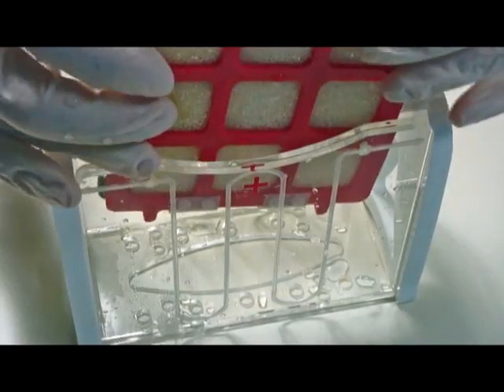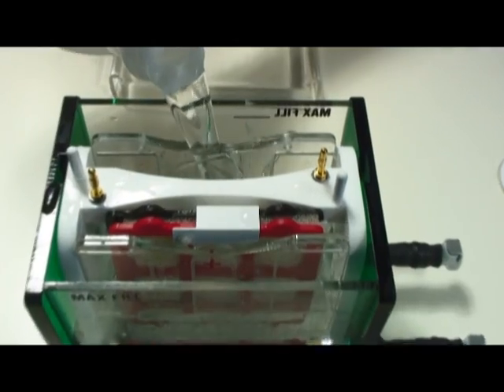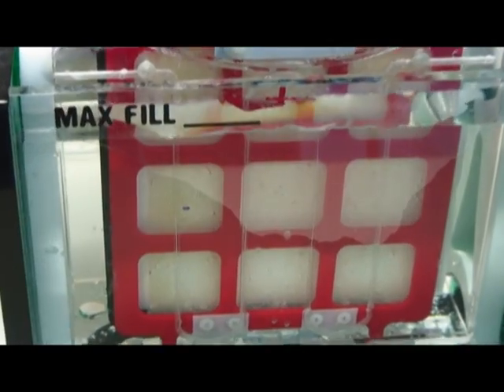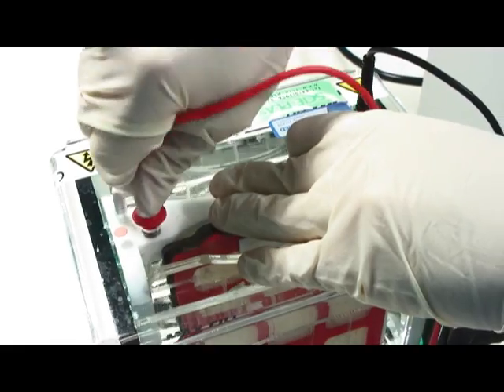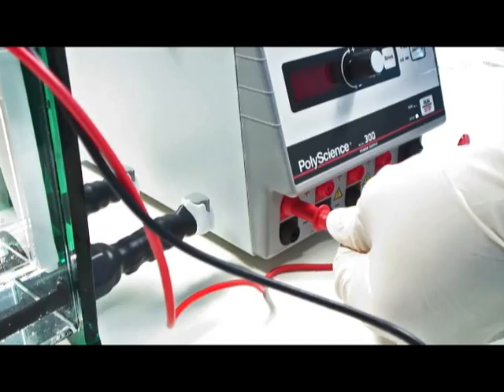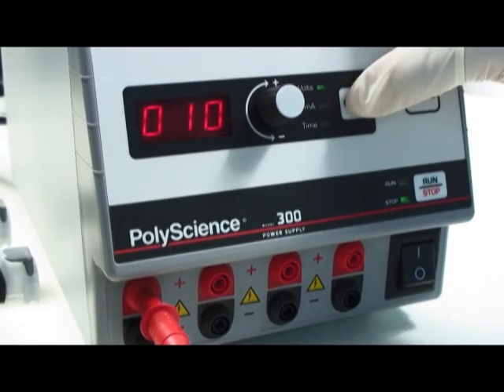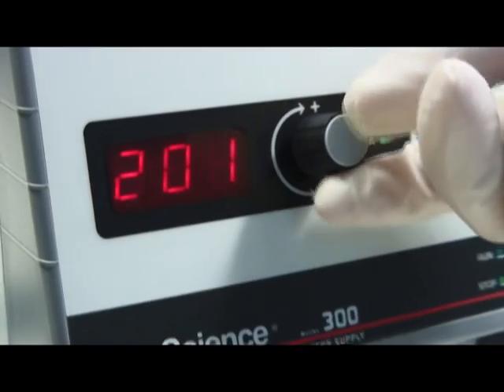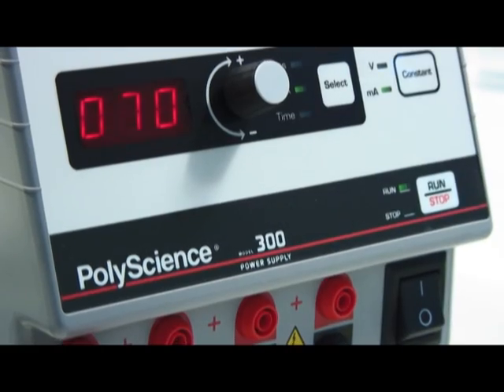Close the system. Put it into the container and then into the chamber. Fill it with transfer buffer. Connect the electrodes of the apparatus to the power source, with the plus pole to the red end. Turn the power on. Set the transfer at 200 mA. Run the transfer for 30 minutes at room temperature.